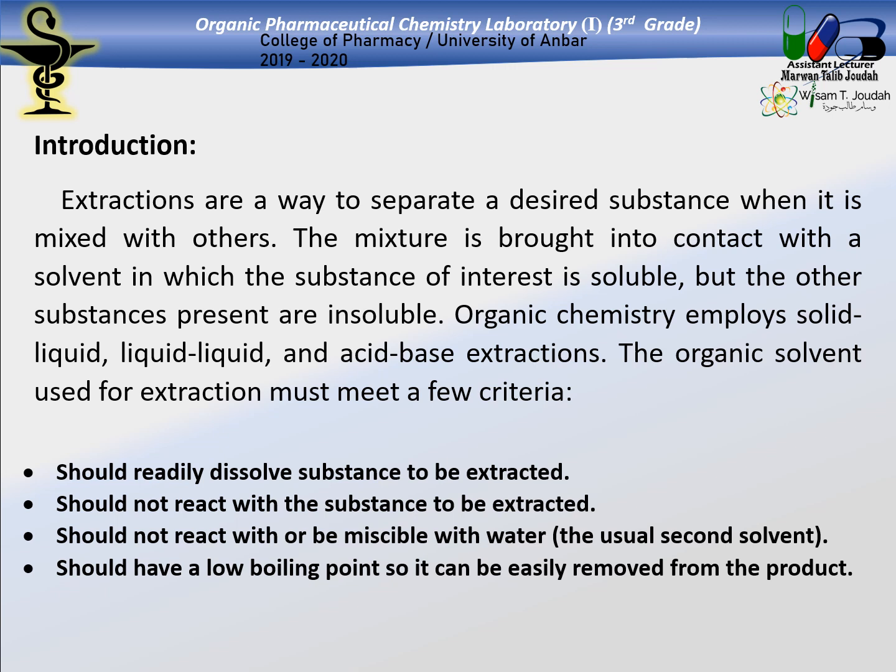يعني على مود يصير عندنا اذا كان liquid two phases, one of them could be less dense and the other more than the previous one. يعني يصير difference in density إذا كان liquid, or it could be a liquid and a solid. فإذا كان liquid a solid, it's easy to get them separated by using a regular filtration process. فهنا الاكستراكشن يا اما تكون liquid والاختلاف بالدنسيتي، اوكي، او يكون على شكل صلب ماده solid وليكويد، واقدر افصلها عن طريق الفلتريشن الاعتيادي.